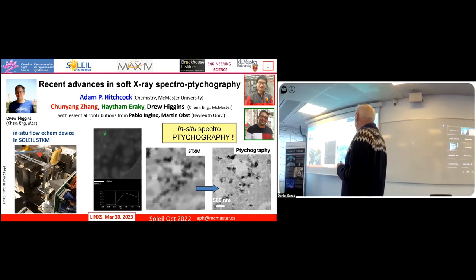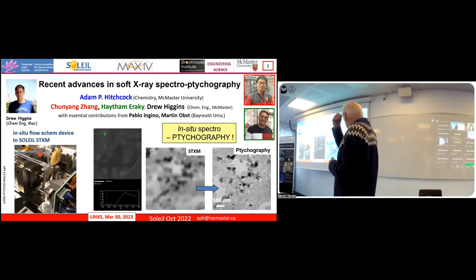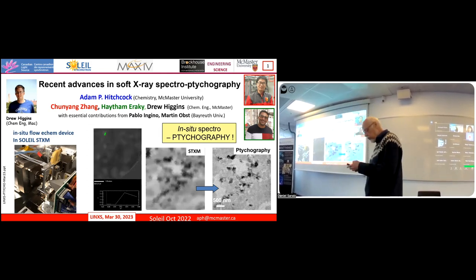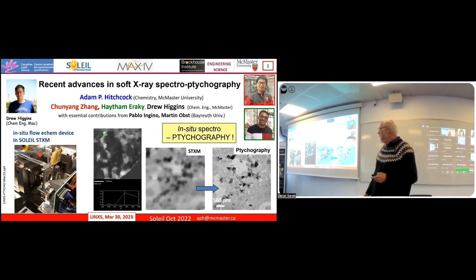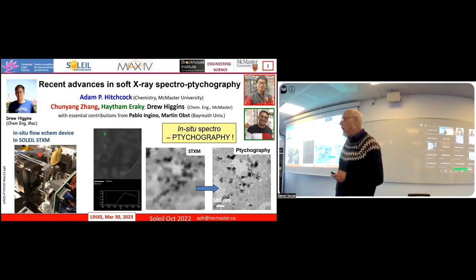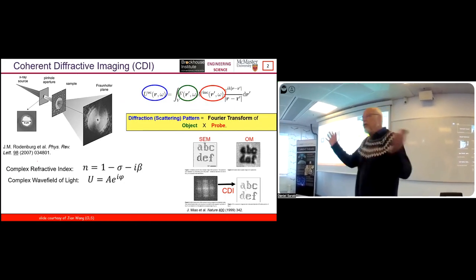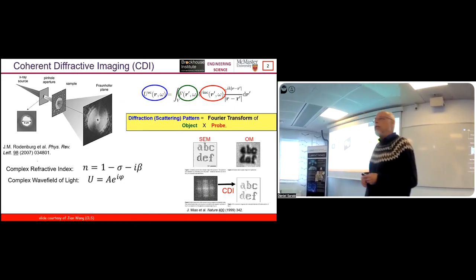And just to show as a single frame, one-to-one comparison of STXM and ptychography, you see a very nice improvement of spatial resolution. That was work that was done at the Soleil STXM beamline Hermes in October of last year. So this is speaking to the converted here very quickly.